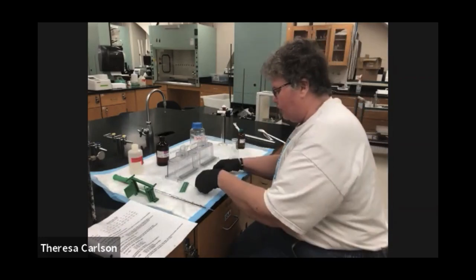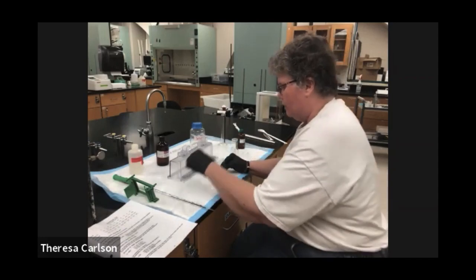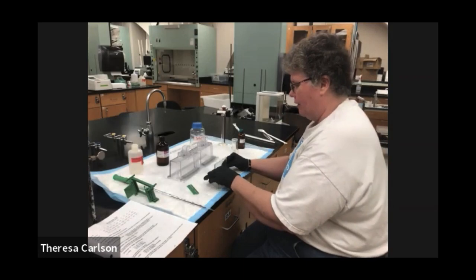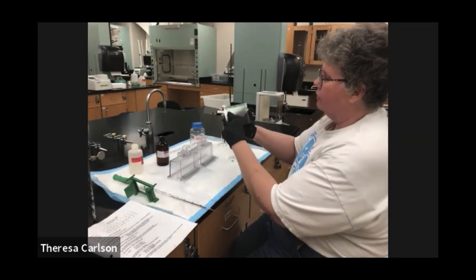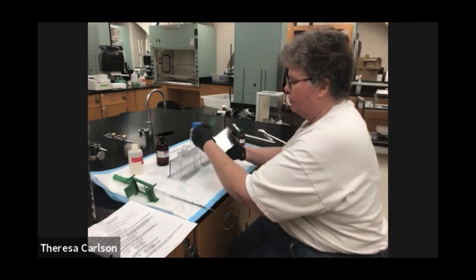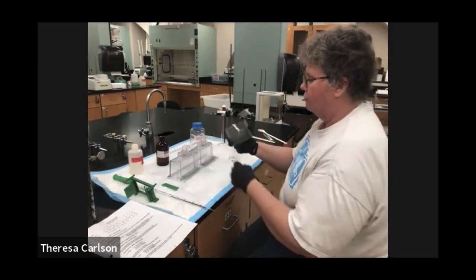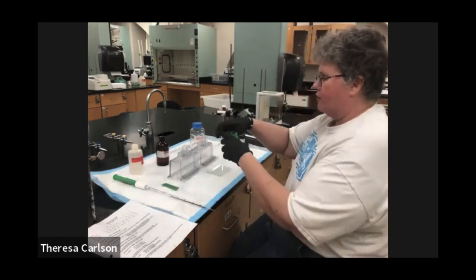Then you want to put together your plates in the assembly rack. To do this, you're going to have two plates together. You're going to have a larger plate with spacers on the side, and you're going to have a shorter plate. You're going to put the comb in between the plates, and make a little mark with a pen just where the bottom of the comb is. Then you can take the comb out. This is approximately where you want to pour your acrylamide to, just a little bit below the level of the mark.